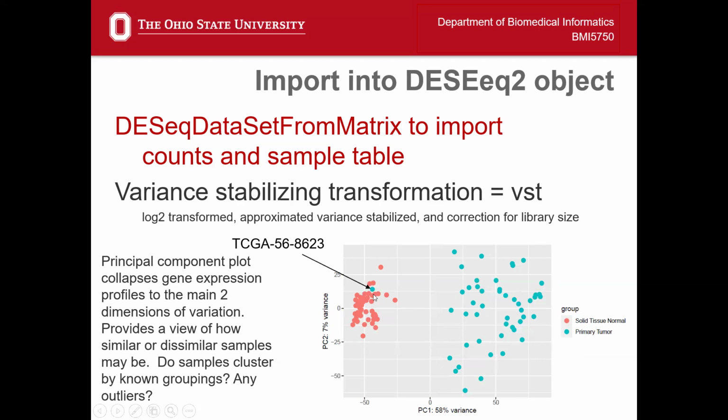In this one, there was a tumor sample that's clustering with the normal samples. I saw that and figured that it is probably a tumor sample that has been misclassified. It's not really a tumor sample. It's probably a normal sample, and it was just given the wrong name in the tube or something. There's something going on here, and we should probably remove that sample.